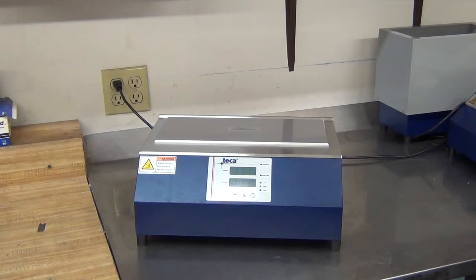Good day and welcome to Tech Labs where we make cool things. Today we're going to show you our AHP 1200 CPV Cold Plate Versatile.